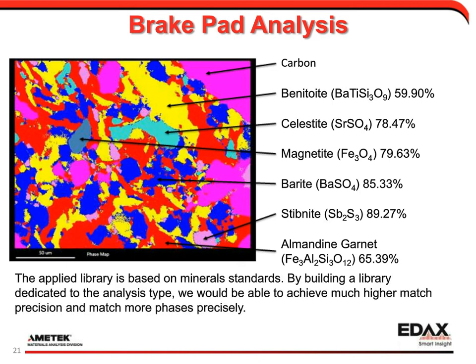Now, I used a mineral standards library here, so I wouldn't really expect to get great matching results, since brake pads are not necessarily made up of these 53 standards that we collected from. And again, this is a used brake pad, so you'll have a lot of contamination and smearing of the different zones. It might have been heated up, have some diffusion, so our compositions don't match up precisely anymore.